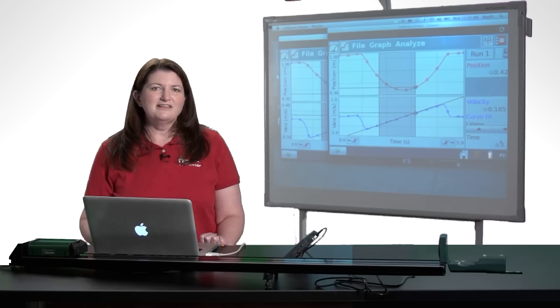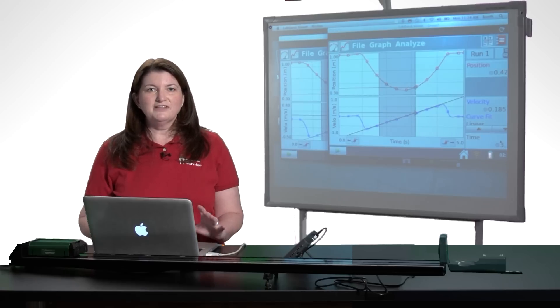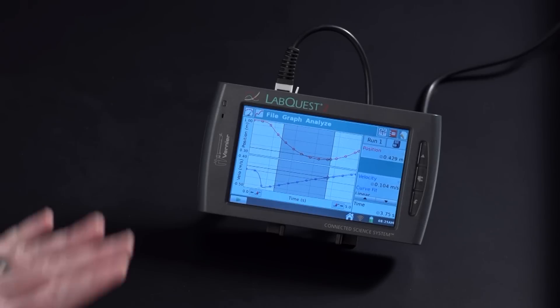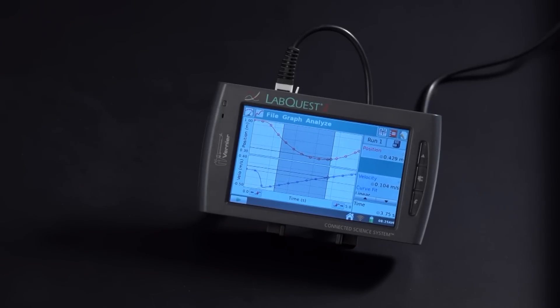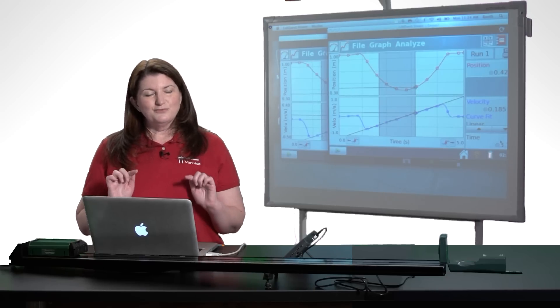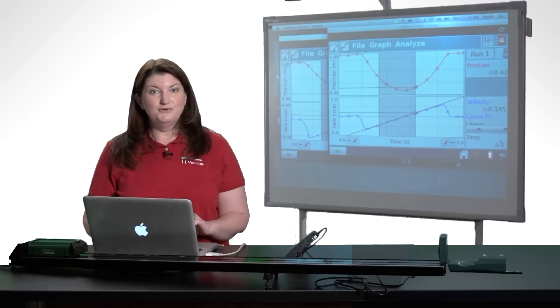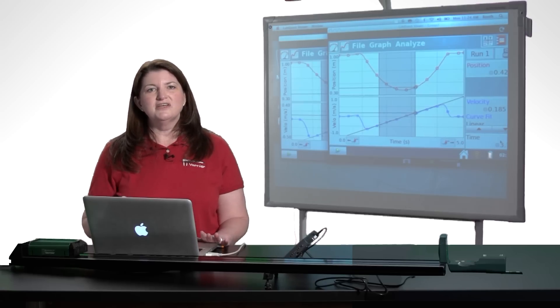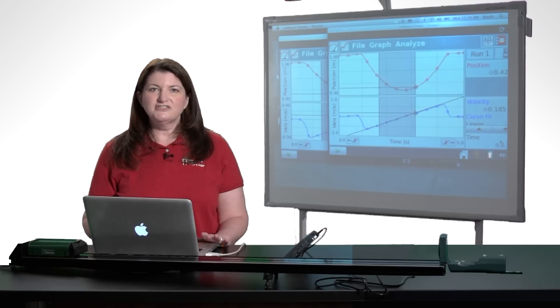The third thing that the LabQuest viewer is really nice for is taking screenshots. A lot of teachers and instructors want to make their own lab write-ups. You can grab a screenshot of instructions or the actual data from a LabQuest. It's an easy way to take a screenshot on your computer to insert into lab instructions. Because LabQuest viewer is an unlimited site license for your school or college department, you can give it to all your students. When they're doing their lab write-ups, they can take screenshots using the LabQuest viewer and insert those into their lab reports to submit to you.